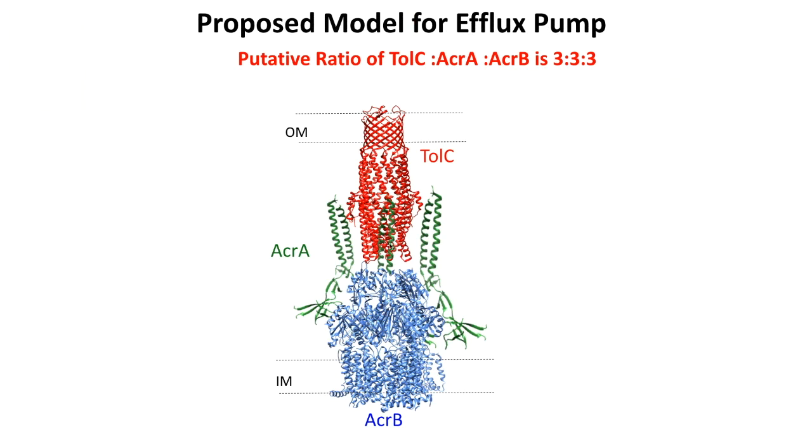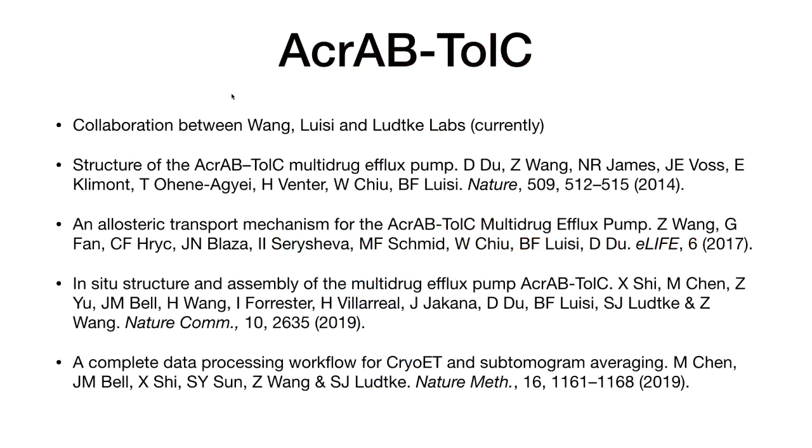So a collaboration between Ben Luisi and Hua Chu and Zhao Wang, who's my current collaborator on this project right now, back in 2014, they published a Nature paper solving, by single particle reconstruction, the structure of the complete assembly at low resolution. But then they followed that up with another paper, a slightly different mix of investigators, in eLife in 2017, which got fairly high resolution, about 5 angstrom, something like that, and really nailed down some of the stuff that they saw here.